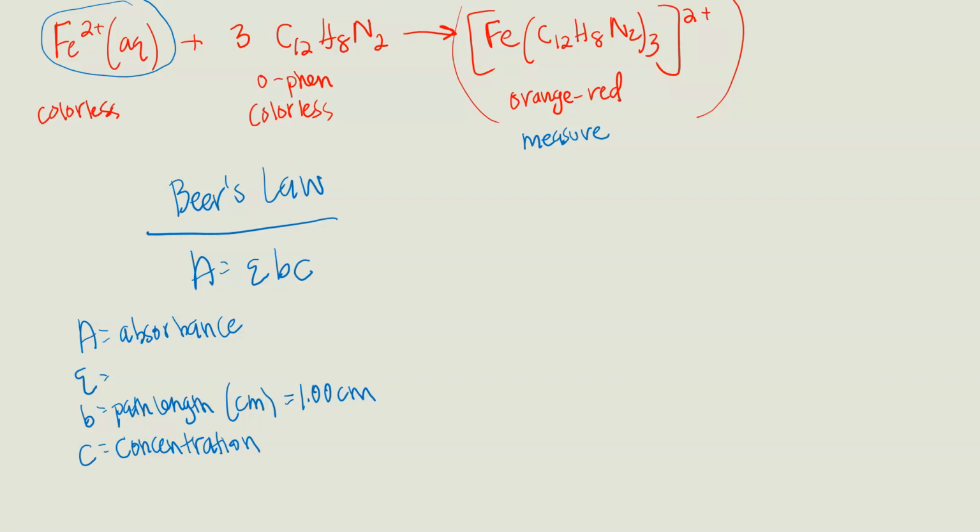Okay. Our little epsilon guy, looks like a squiggly E, is either called the extinction coefficient or the molar absorptivity. I'm going to call it the extinction coefficient because the term molar absorptivity kind of assumes molarity is the unit that we're dealing with. So the extinction coefficient is a constant, kinda. It's a constant that is temperature dependent, reaction dependent, and instrument dependent. So whenever we do spectrophotometric analysis, job number 1 for the lab is figure out what the heck the extinction coefficient is. So it's a constant, and it has units, but the units vary.